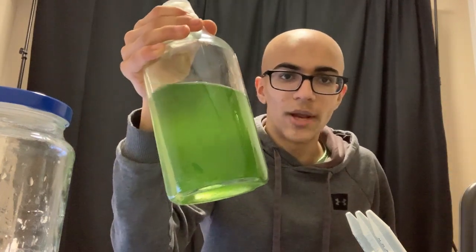You can see this one's way more green than the one I started with in phase 1. And hopefully that'll make sure that the algae grow faster and get me faster results. The other thing I did was buy a nitrate meter that is actually quantitative, so I don't have to use one that's more qualitative like the one I was using before. Hopefully I'll be able to explain a little bit more about how this one works next week.